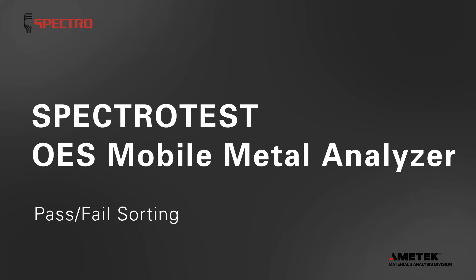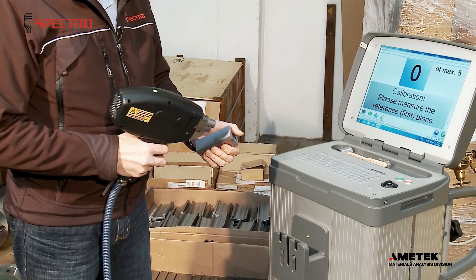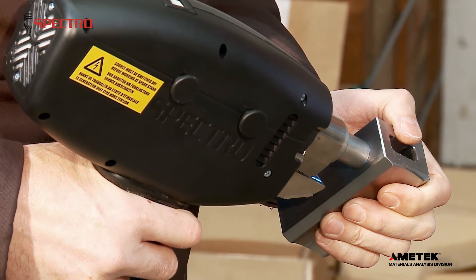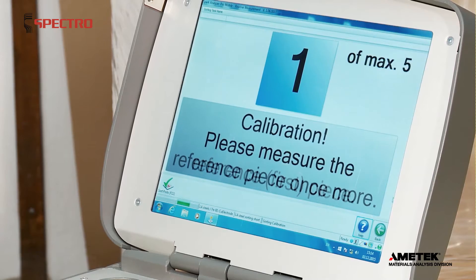SpectroTest OES Mobile Metal Analyzer Pass-Fail Sorting. For fast checks of large lots, to make sure all pieces are the same alloy and grade, use SpectroTest's Pass-Fail Sorting option in Arc mode.